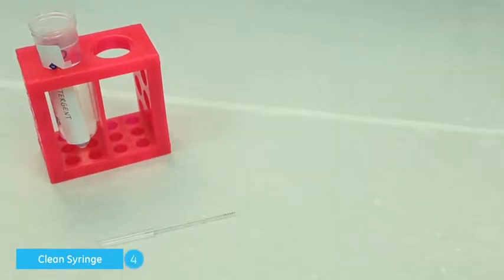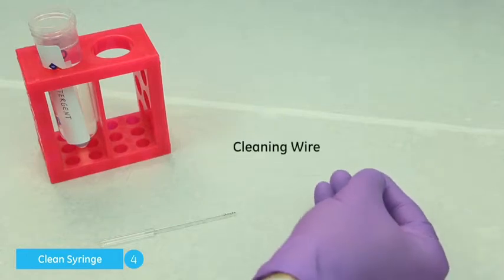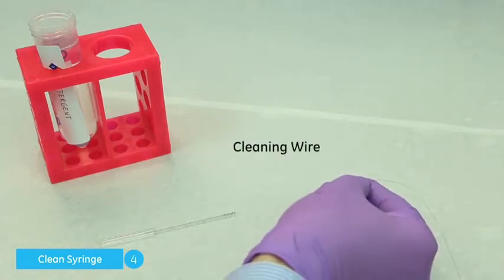Best practice is to occasionally clean the glass syringe by hand, as the instrument does not clean the entire inner diameter of the glass syringe. If there are any blockages in the syringe, these should be taken care of before cleaning using the supplied cleaning wire.